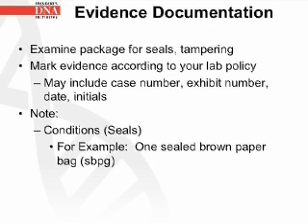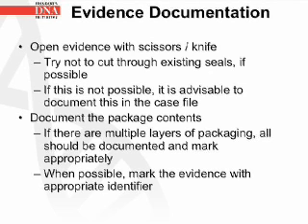Evidence documentation. Examine package seals for tampering. Mark evidence according to your lab policy. This may include case number, exhibit number, date, and initials. Note the conditions of the seals. For example, one seal brown paper bag can be written as SBPG.